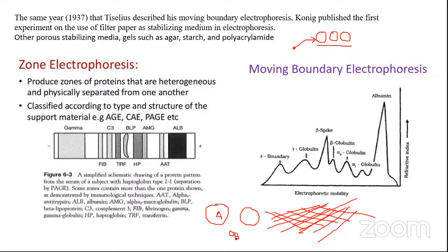So now the reverse is true in case of chromatography. Because there is no external field applied, a bigger molecule can pass through the gel quite fast because it passes through the spaces in between these beads. So that's a different story altogether. But in electrophoresis, the smaller the molecule, the greater will be its capacity to migrate through the gel, depending upon the pore size of the gel.